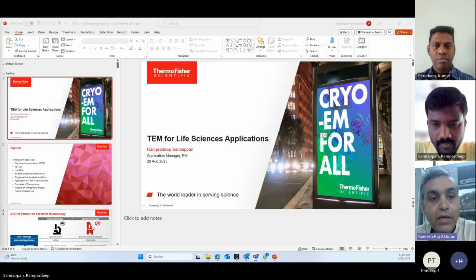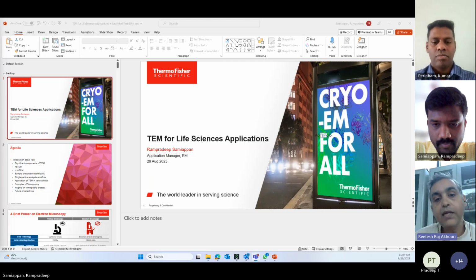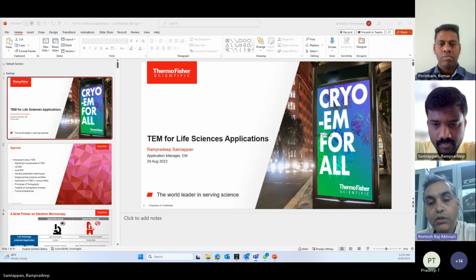Dr. Samyappan has worked with Professor Hans Hebert and Professor Caroline Jägershold at Karolinska Institute, where he worked on trying to visualize exosomal microRNAs, and he has also worked with membrane proteins, how they integrate in the nanodisk. So he has quite a bit of experience working with different kinds of samples, and currently he's working with Thermo Fisher. He will share his knowledge about handling various kinds of samples in negative stain as well as in native condition. So we are going to have a very practical talk today about how you should analyze your sample before you start to collect data for high resolution cryo-EM.